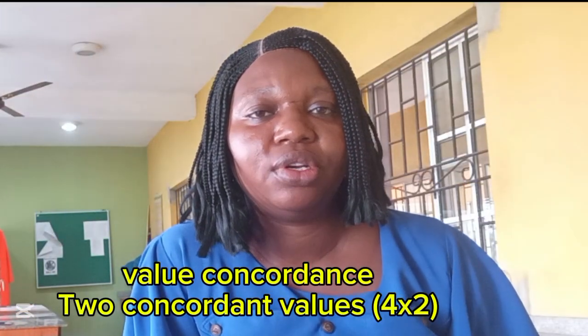Concordance of value. Your titration value must be concordant to your teacher's value. Every chemistry teacher will always do the same practical with the students, and a report form will be submitted to WAEC. This report form is what examiners use to judge or mark the students.